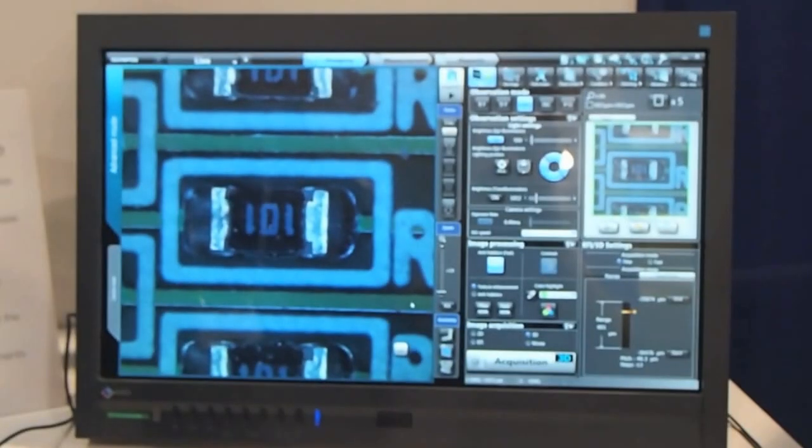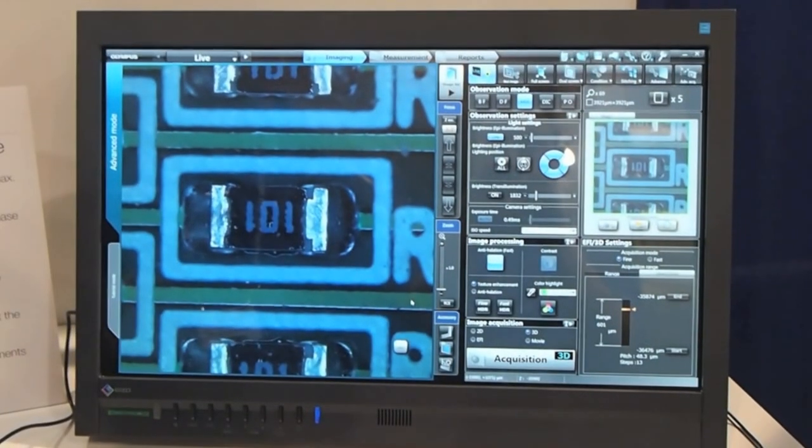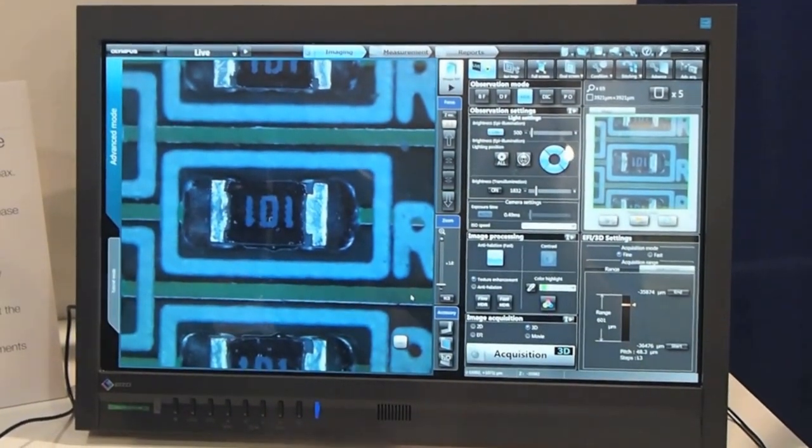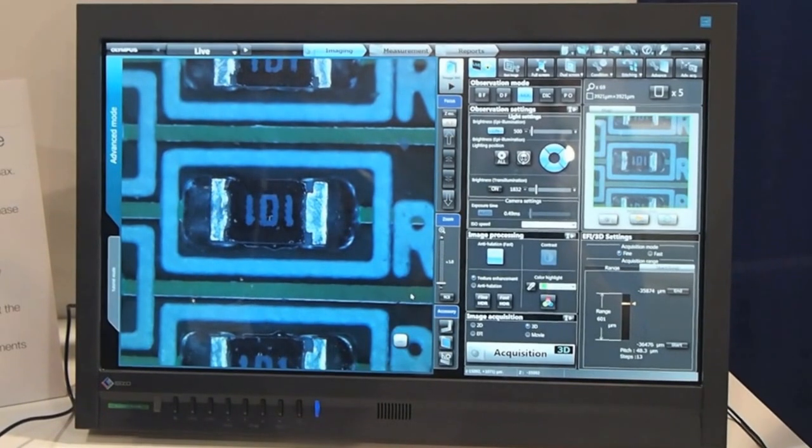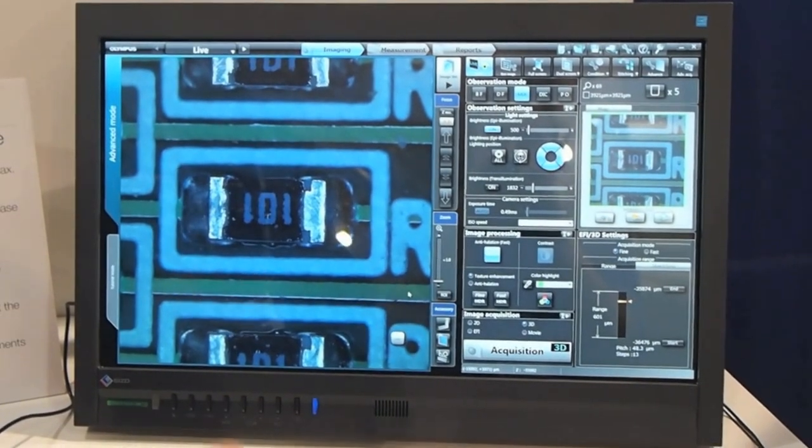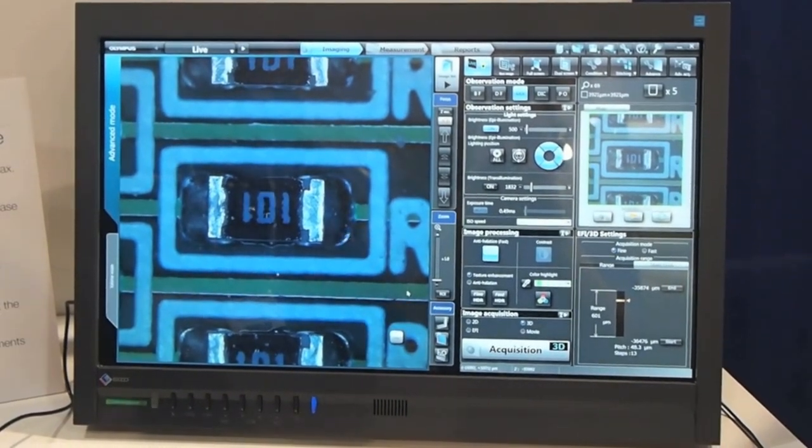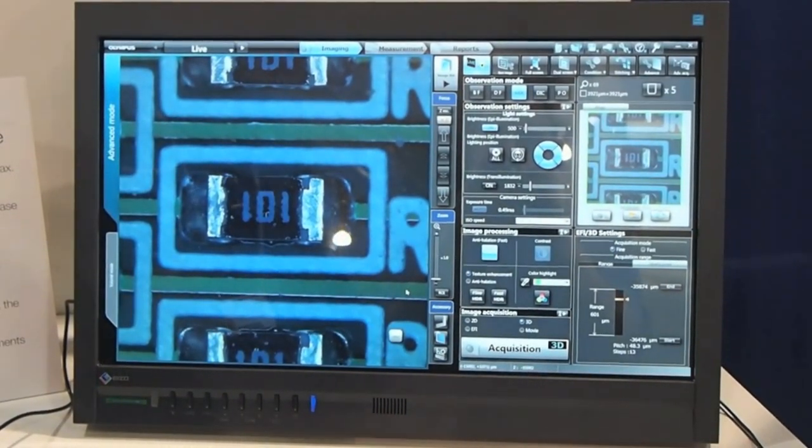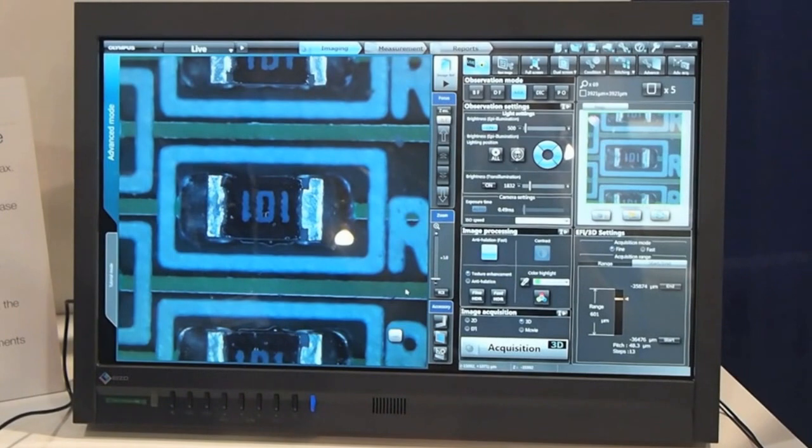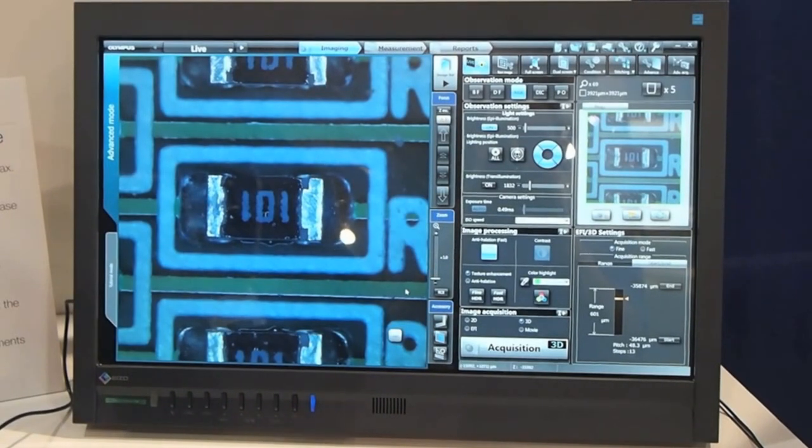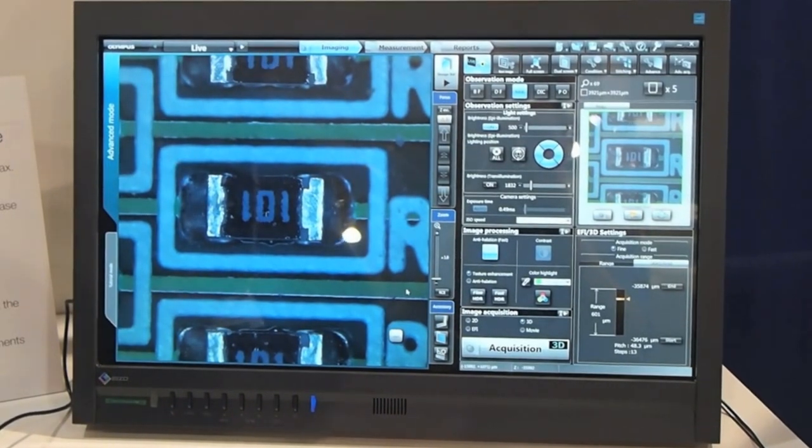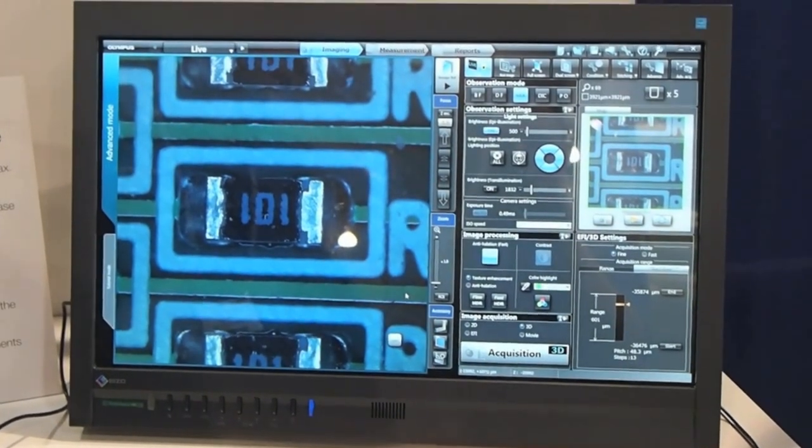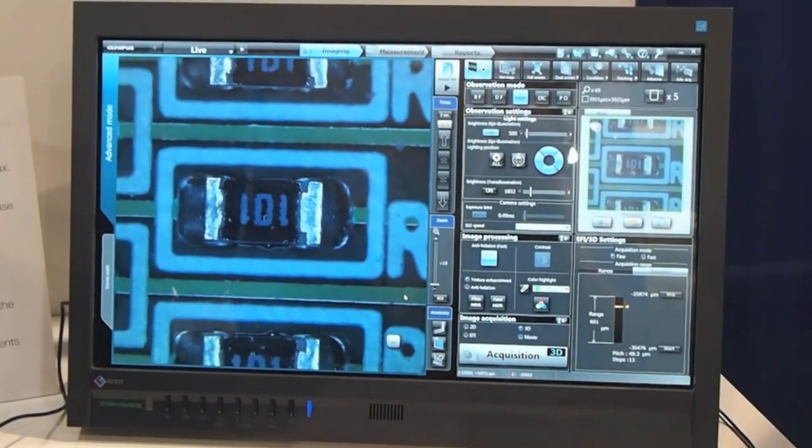Next I'd like to show our live stitching capabilities for panoramic imaging. Sometimes the field of view is not large enough for what we're trying to see. Here we're only seeing one component on the sample at our lowest magnification with this lens.